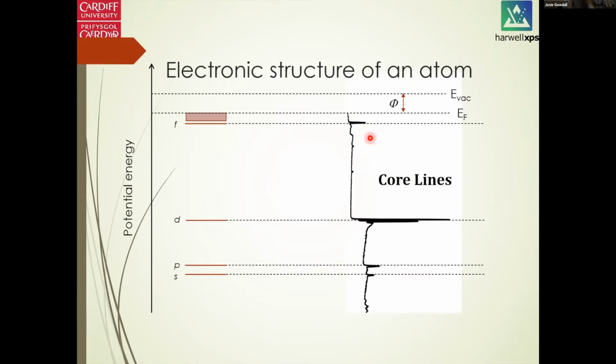So if we rotate the typical XPS spectrum 90 degrees, we can fit well in this diagram. And the valence band area is located in this very low binding energy area. Most of the time, it's difficult to see these fingerprint features with XPS spectrum. And with UPS, we will be able to look closer to this area and work out some key information such as the work function.